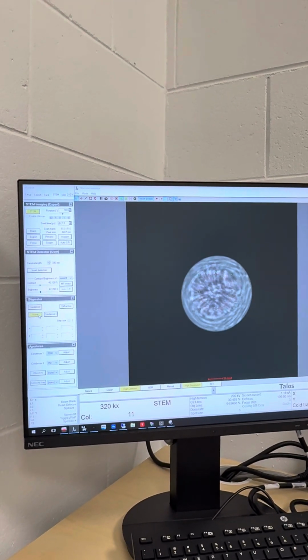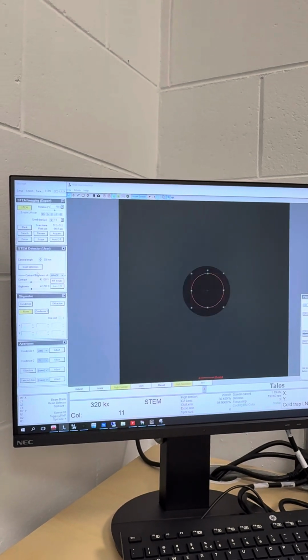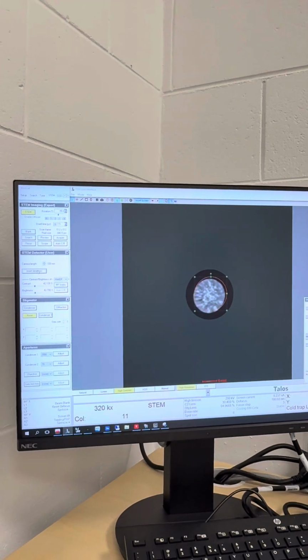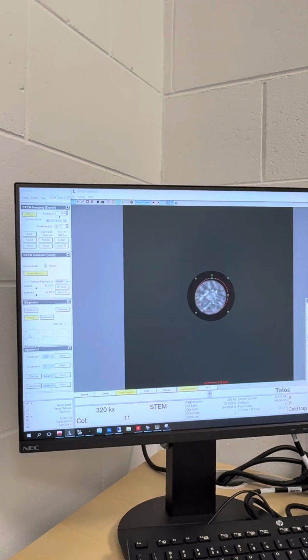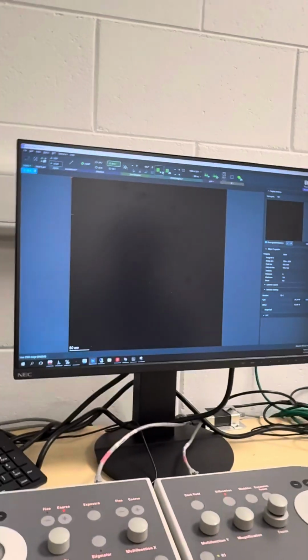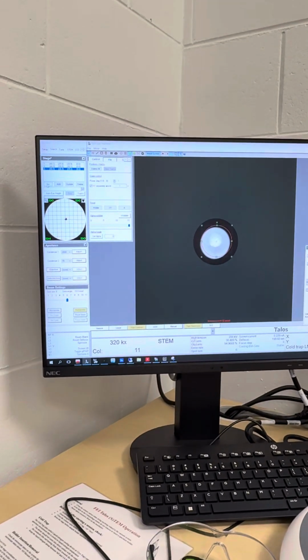So click done, we go back to smaller aperture, and we insert the detector. If you're a new user, it's just advisable to go through all the values here, pick the best one, and then do the final adjustments on the image. So now let's go to the image and recall the previous position.